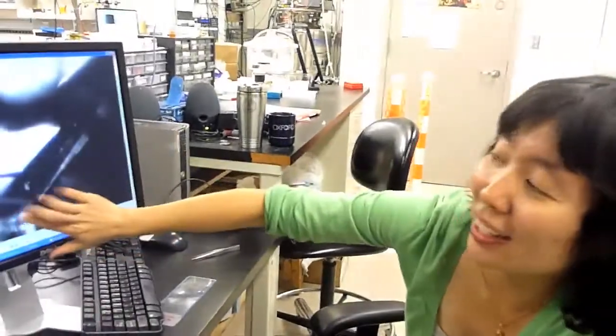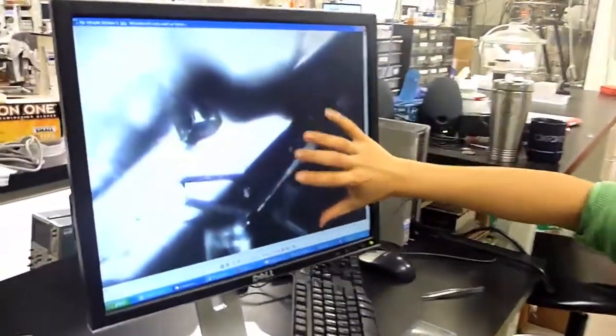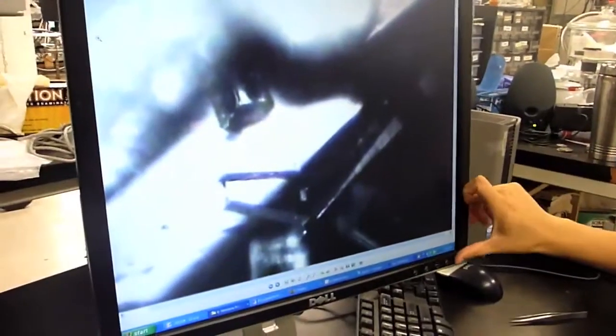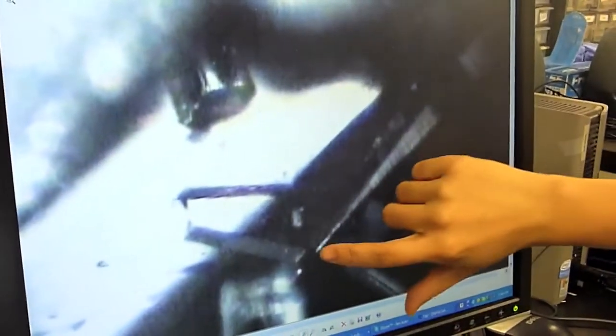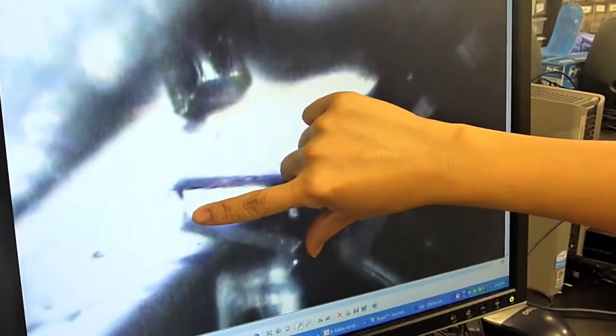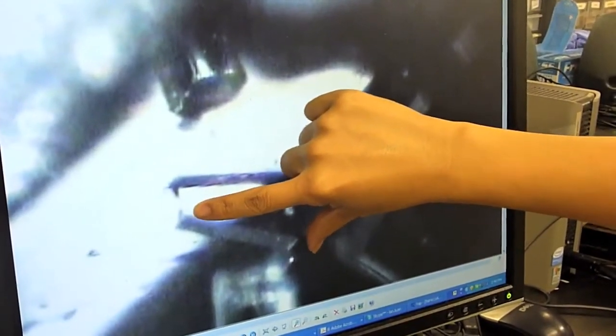So here is a zoomed-in picture of the scanning pad that I just showed you over the instrument. First, let me tell you how zoomed-in this picture is. This scale here, the length of the cantilever that we use to scan is about the diameter of your hair. So everything in this image is super small.